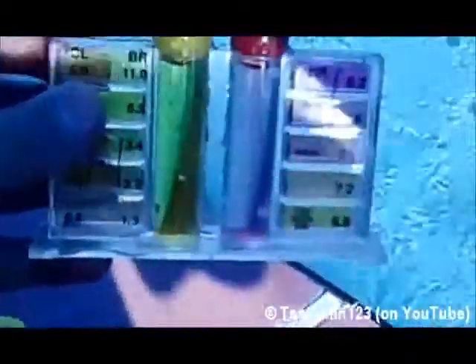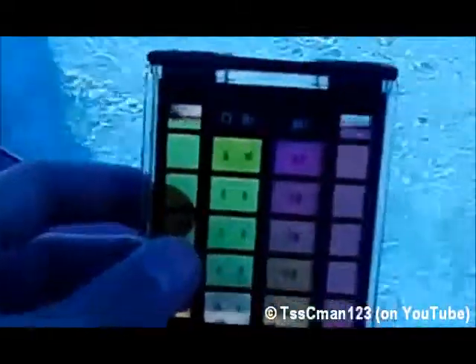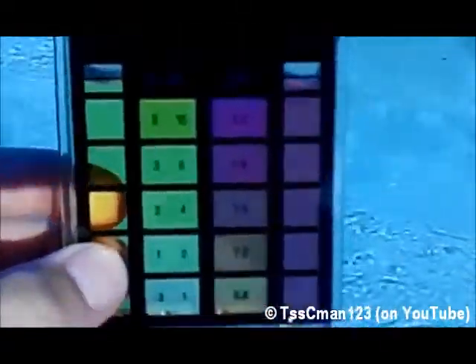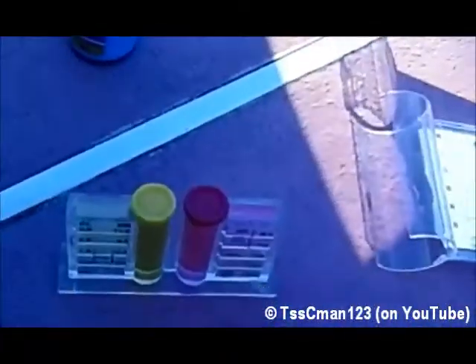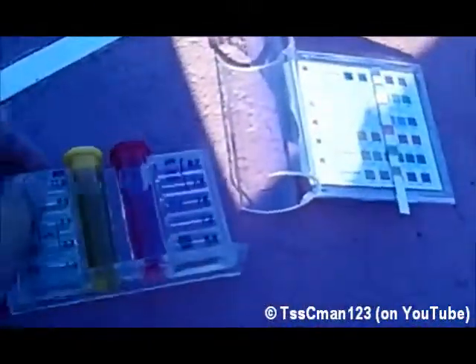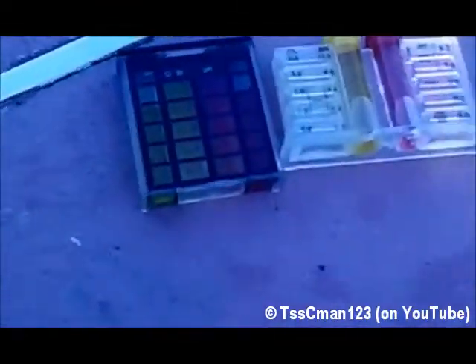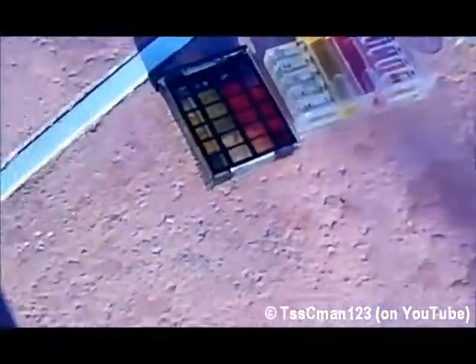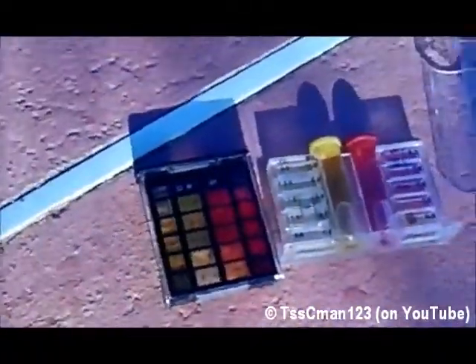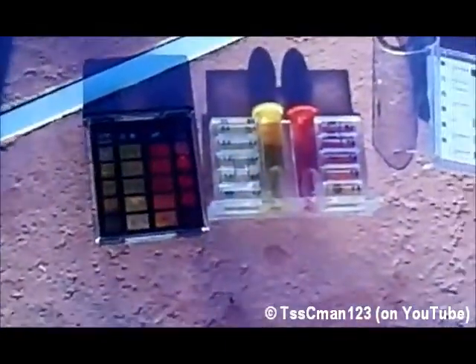Here's the Aquachem comparator filled up. Here's the Taylor comparator filled up. You can tell this one's a lot easier to read because of the black lines versus these right here. You can tell these both read about the same.